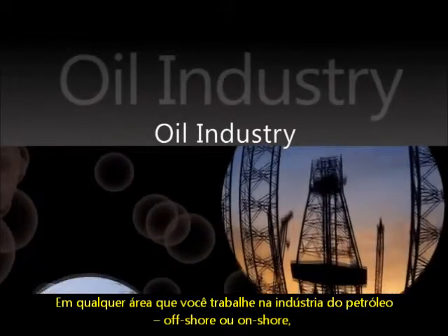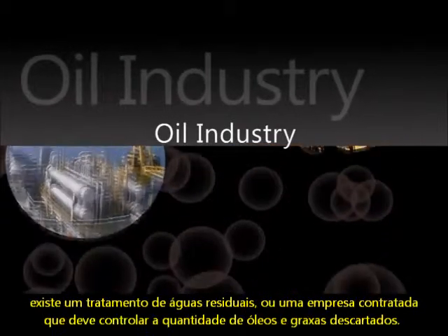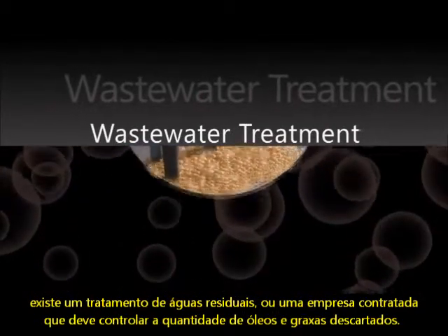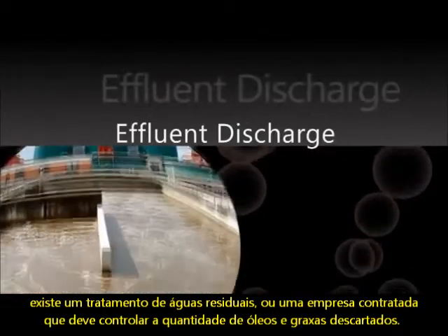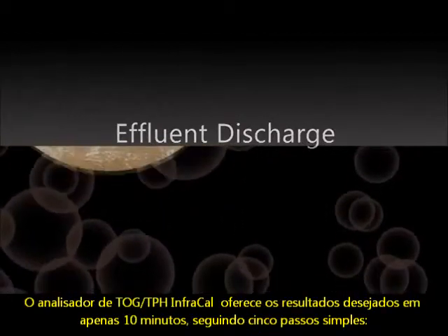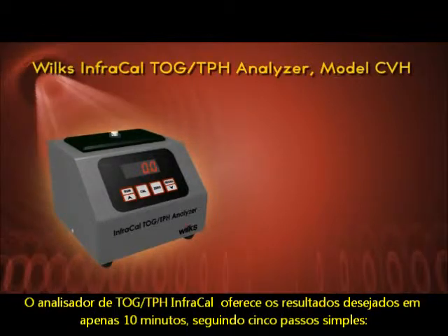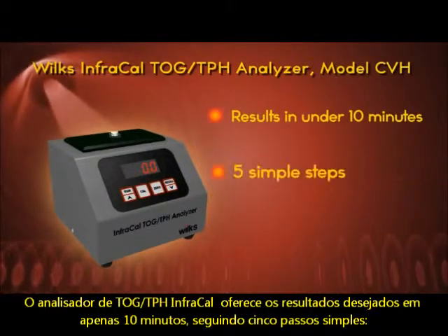Whether you work in the oil industry, offshore or onshore, are a wastewater treatment professional, or employed by a company that must regulate the amount of oil or grease in its effluent discharge, the Wilkes InfraCal TOG TPH Analyzer will give you the measurement results you need in under 10 minutes with just 5 simple steps.